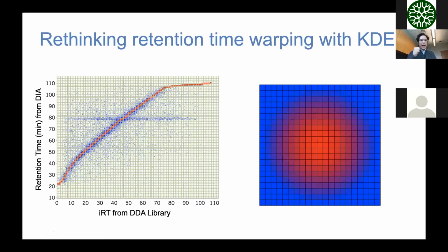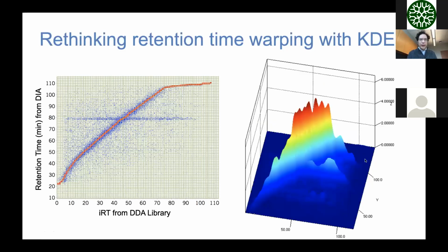And as they stack up, we can see them rise. So we can look at the shape of this retention time profile as those piles of stamps stack up on top of each other. We can see this clean shape across the retention time space. So even though, for example, there is one run in the library that is incorrectly calibrated, this doesn't interfere with our ability to trace the shape by walking down the ridges of this landscape of retention time that we're seeing here.